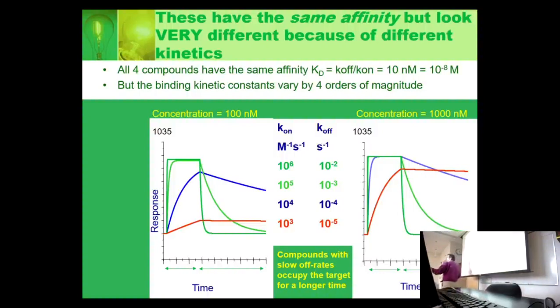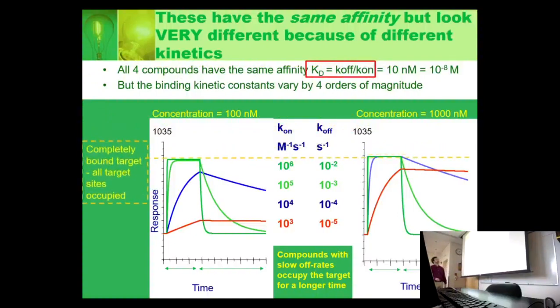And I want you to see that in May, this will be our topic for discussion. But you do actually get useful information from the kinetics. And this equation is what's really important for you to understand eventually.